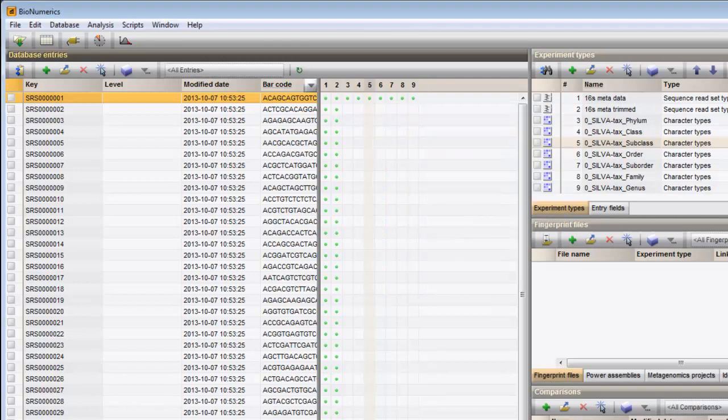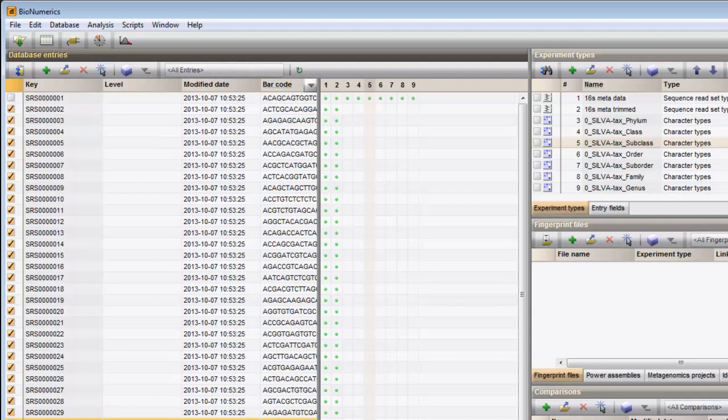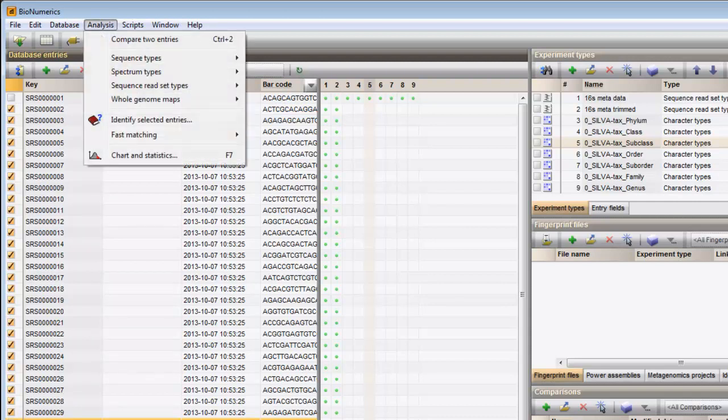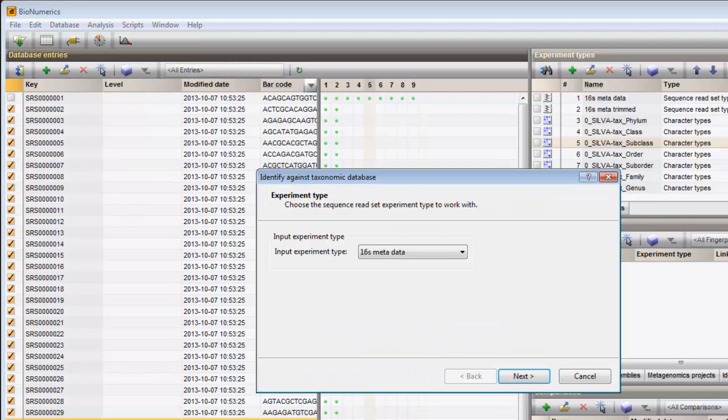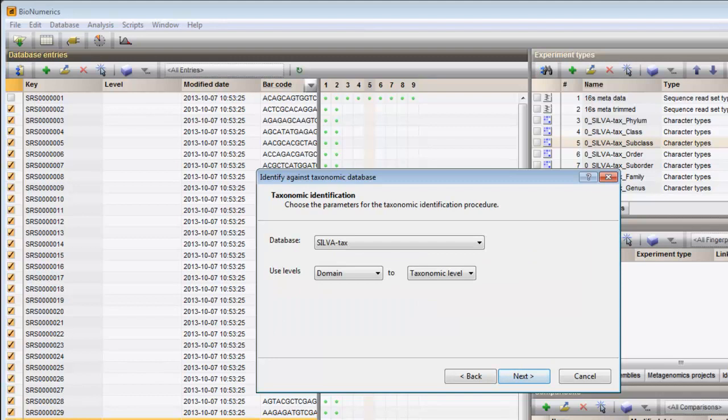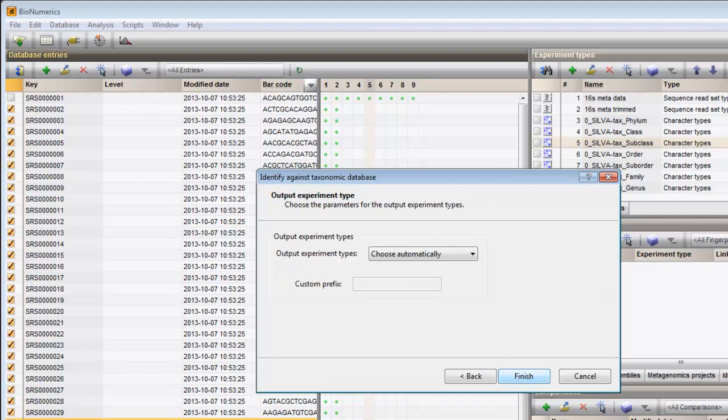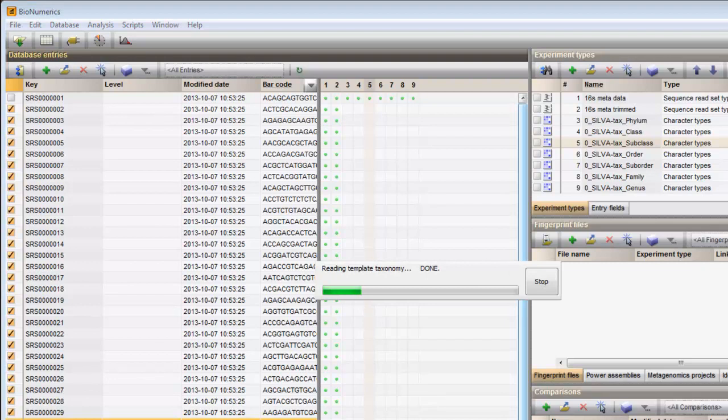Note that analysis on sequence read sets can be initiated on multiple entries simultaneously. Select all the entries that you want to use in the analysis, and select Analysis, Sequence Read Set Types, Identify against Taxonomic Database. Press Next, Next again, and Finish. This will start the calculations without opening the Metagenomics window and launches one Metagenomics analysis after the other.